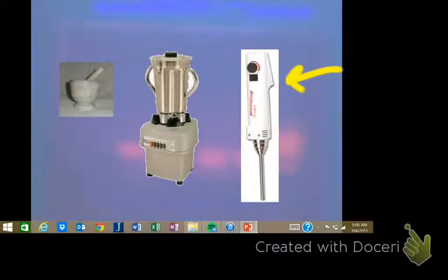Okay? Now, in the lab that I did research in during my undergrad days, we just did it out in the open. You know, we just hold it. And it makes this high piercing sound, which is not good. I can blame some of my hearing loss on that, I think. But then when I got to grad school, we had little soundproof boxes, and we have one of those in the lab.